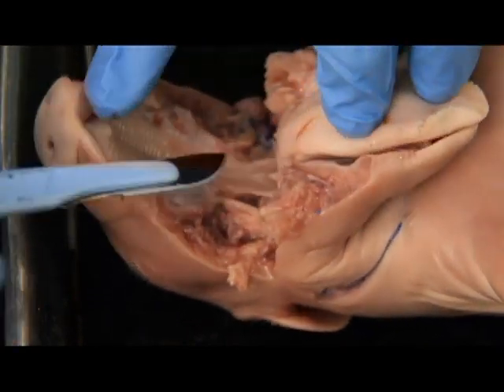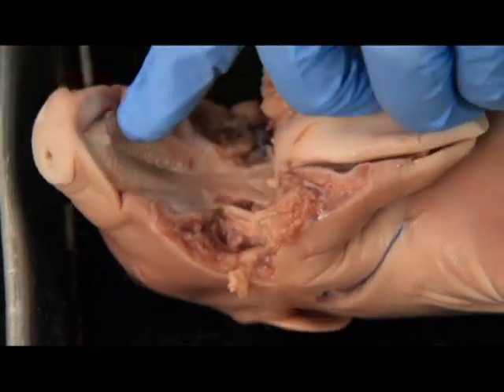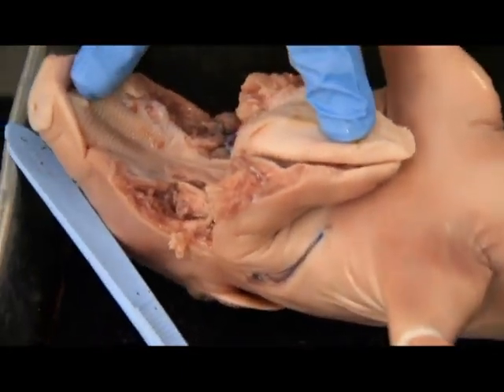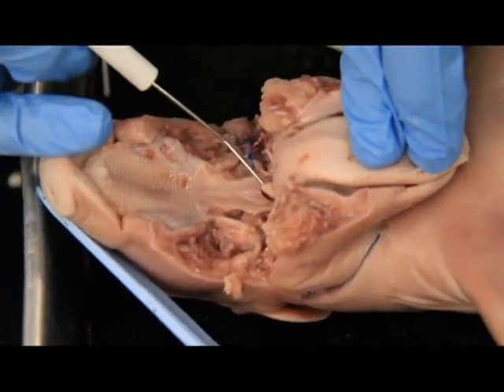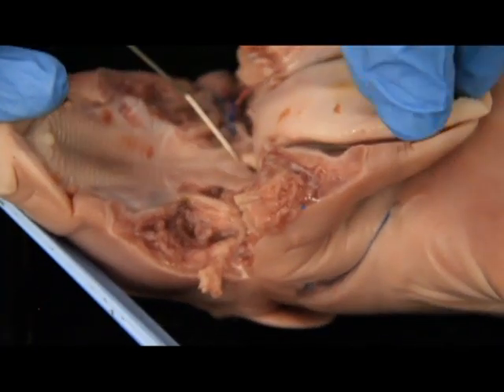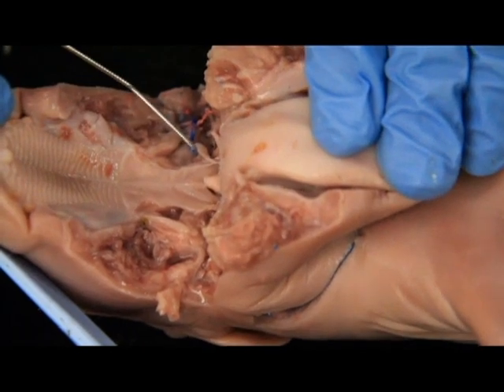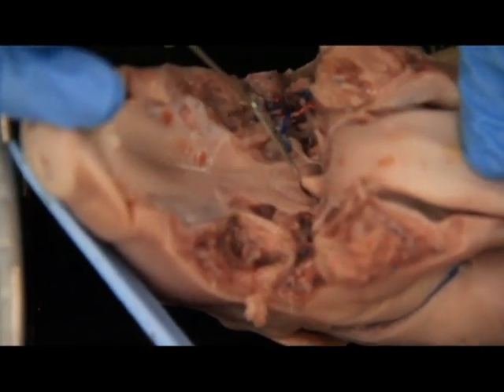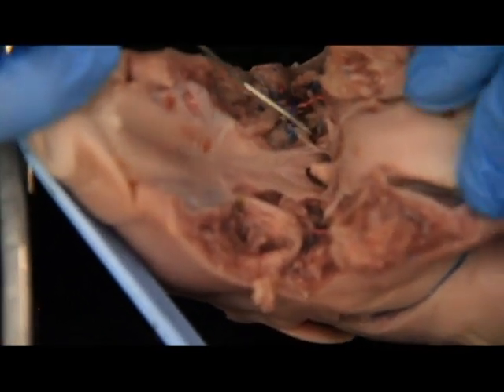Keep cutting, and then there. You can stop once you see this little flap. And this little flap right here, that little flap is the epiglottis. So that epiglottis will actually flap up and down as you breathe and swallow. So it flaps up when you breathe, so your airway goes all the way down, and it flaps down to close off when you're swallowing so that food doesn't enter your airway.